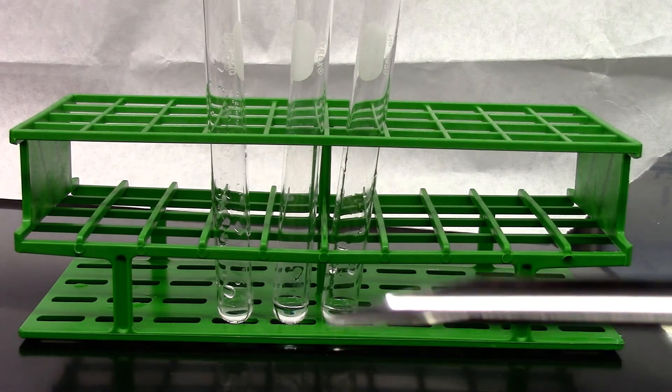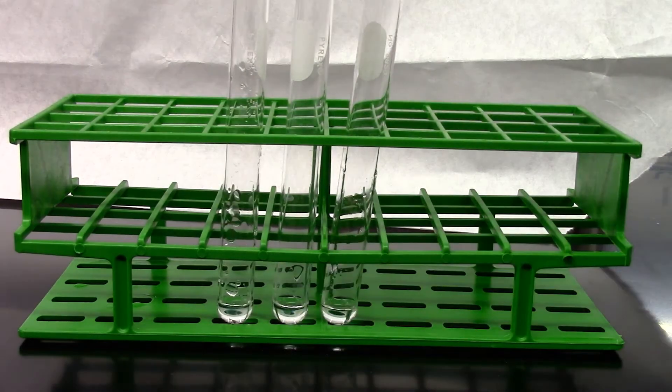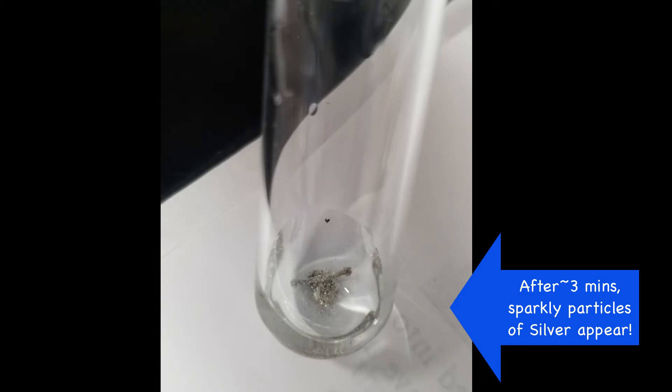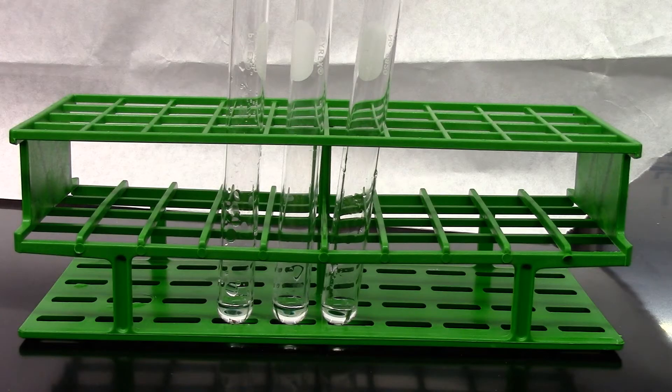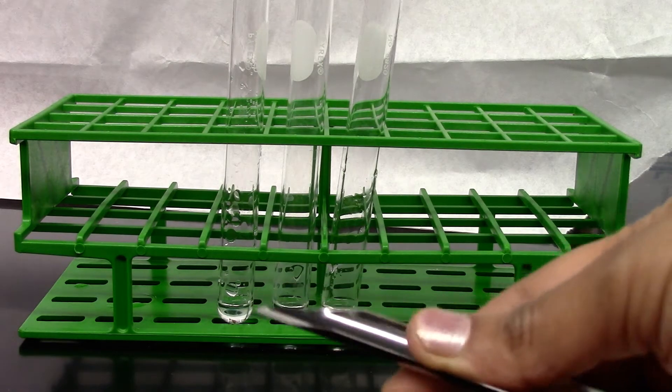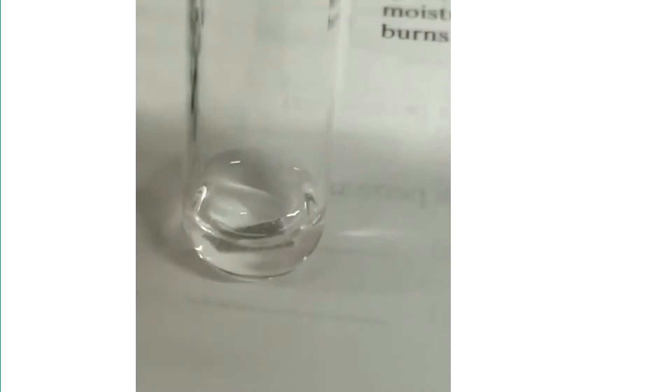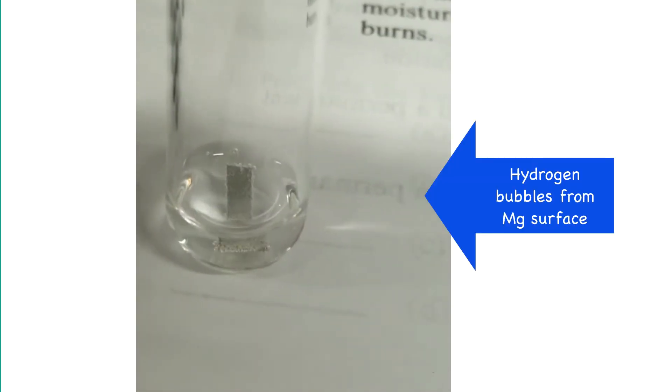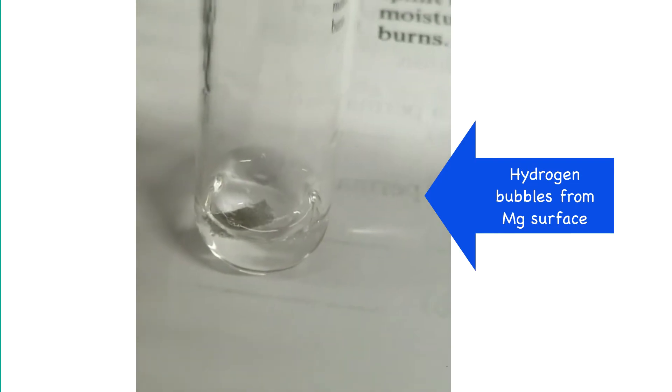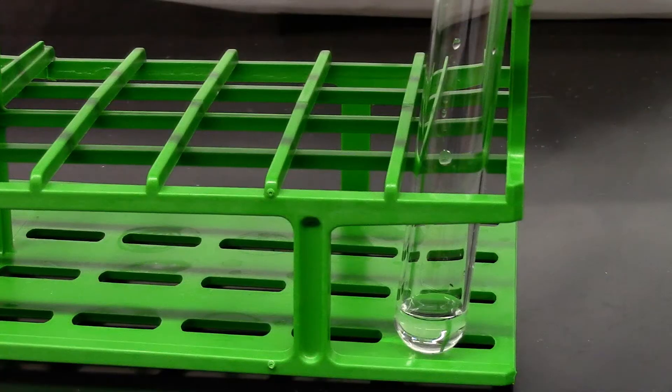So to the first test tube I'm going to add a small piece of copper. The second test tube I'm going to add a small piece of magnesium. And the third test tube I'm going to add a tiny piece of calcium metal.